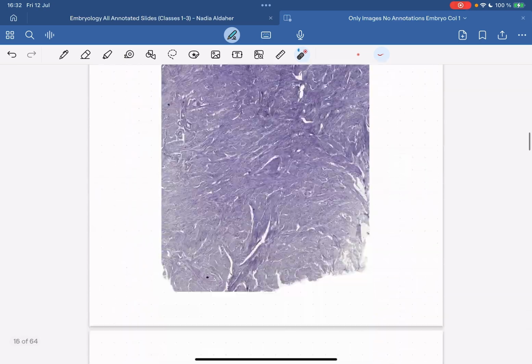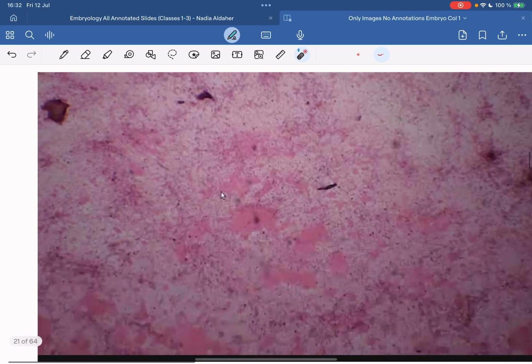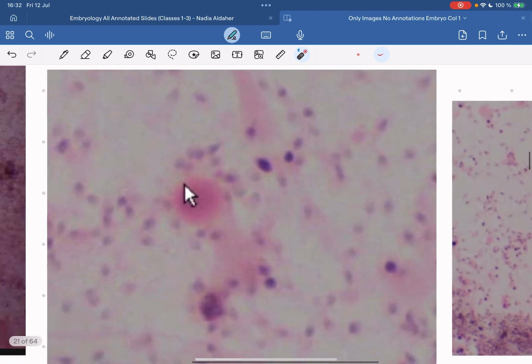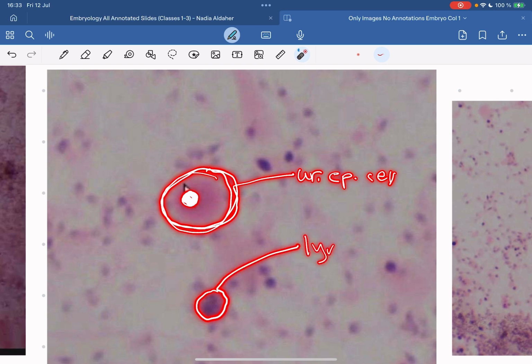Okay, that's it. Again, the most important, well, we can look at the demo lab as well. So like I said, during the demo lab, this is how it might look like in the colloquium. And again, it looks very chaotic, but when zoomed in, you will be able to see the human urethral epithelial cell. Only here, you can only see the cytoplasm. The nucleus is hidden by this mouse, but the nucleus would theoretically be here, and then we had this cytoplasm, so we'd know that this is the urethral epithelial cell. While this, which only has a dark nucleus, would be the lymphocyte.